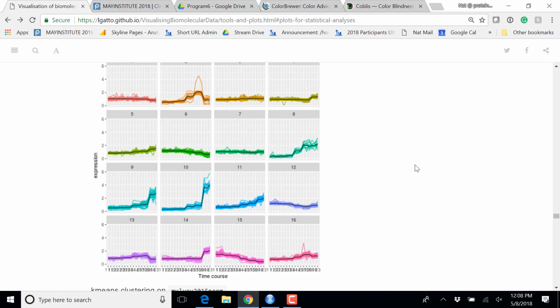So that is using the k-means function. But then rearrange this data set into a long table, and then use ggplot2 to produce this thing. Producing something like that with base graphics is not impossible, but it would not be straightforward. It's actually relatively not too difficult with ggplot2.